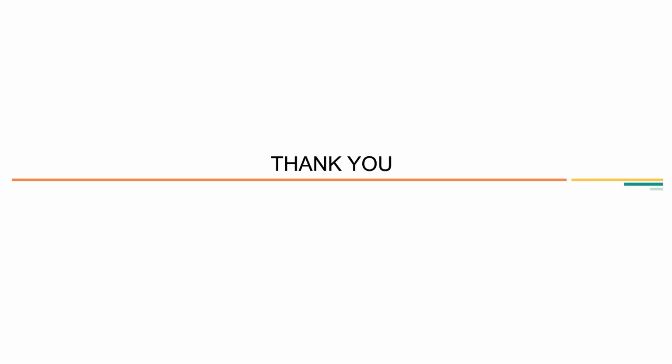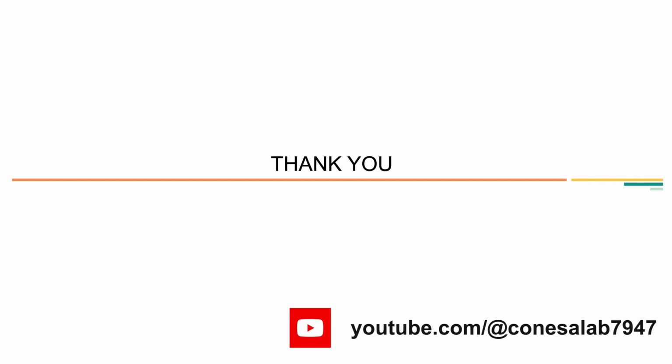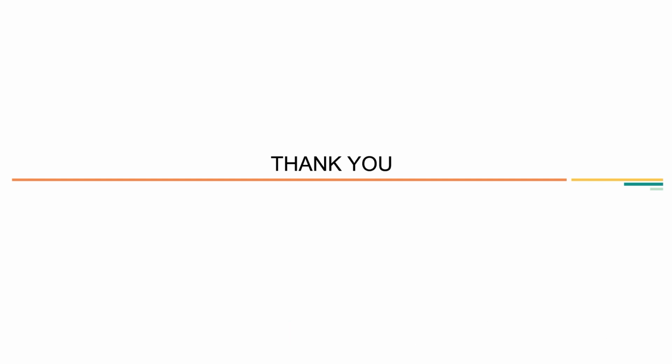And that's it. SQANTI3 is a powerful tool for characterizing and filtering long-read defined transcriptomes, with its main focus on isoform classification, quality control, and artifact filtering. The recently added Reference Transcript Rescue module offers an additional step to ensure that no valid transcripts are lost in the filtering process and to expand the filtered transcriptome. With its wide range of descriptors, comprehensive reports, and ability to combine data sources, SQANTI3 is a valuable tool for anyone working with long-read transcriptome data.